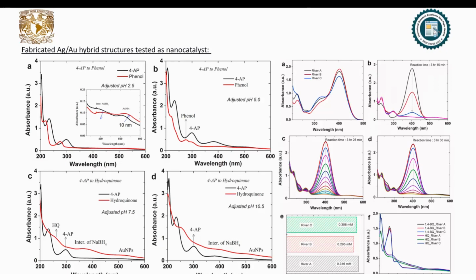After that we did the calculations of percentage of degradation, and we can say almost 31%. Here also there is beauty, in that the aminophenol production is almost consistent, either in distilled water or in river water.